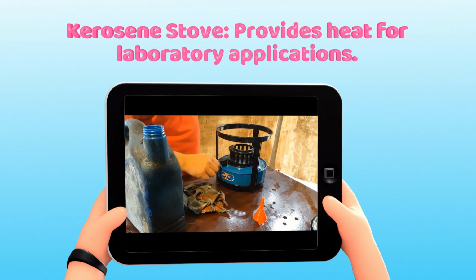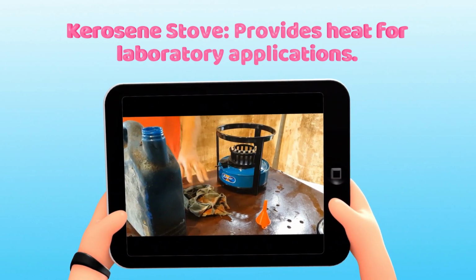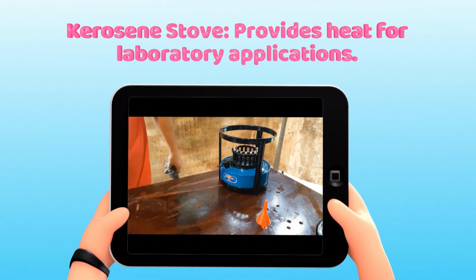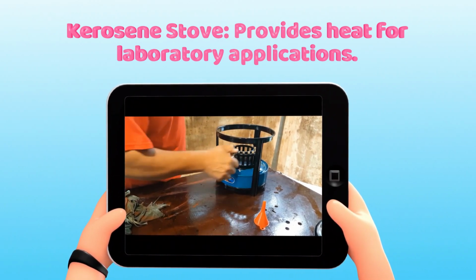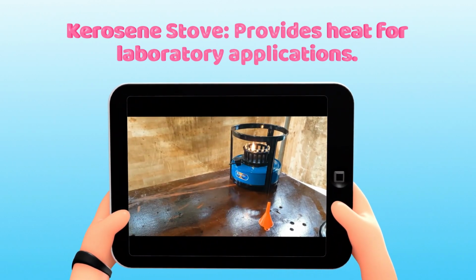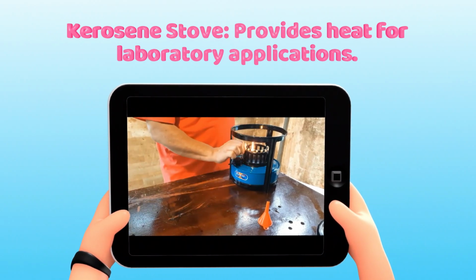We use kerosene as a source of energy. We put it in the stove so that once we light it, it can give heat for heating purposes. Generally, it is not the most commonly used in a laboratory, but it helps for heating purposes.